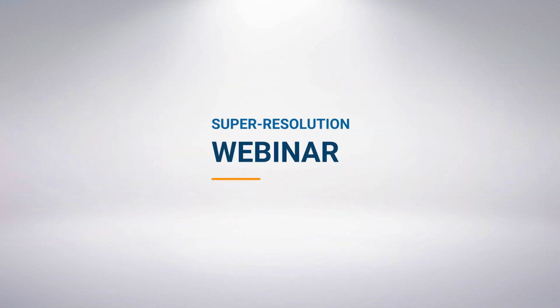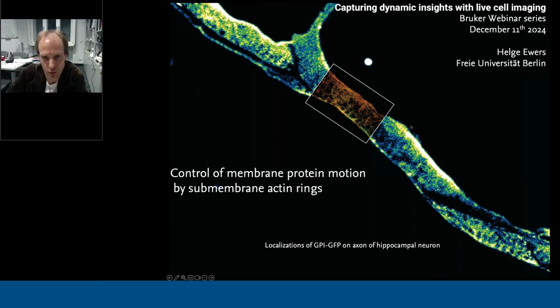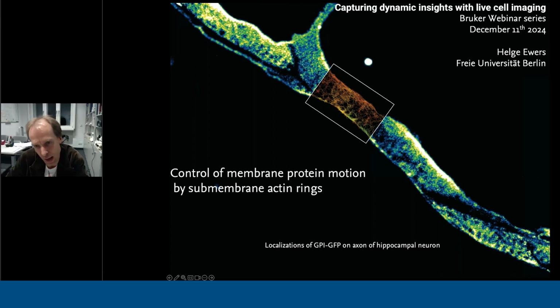And a short summary of what I'm going to talk to you about today, you can see already in this very first image here. This is, of course, an artist rendering in a way, what Jakob has been doing at the time. And what you can see here is in the blue greenish, these are localizations of molecules as they were diffusing along an axon of a cell. And you can very nicely see here this sort of ribbed structure, those sort of individual rings around this axon.